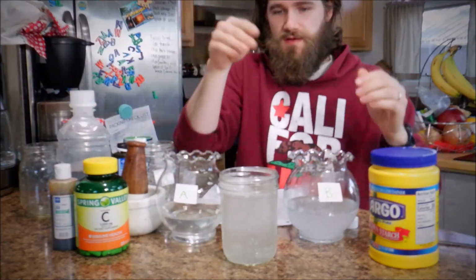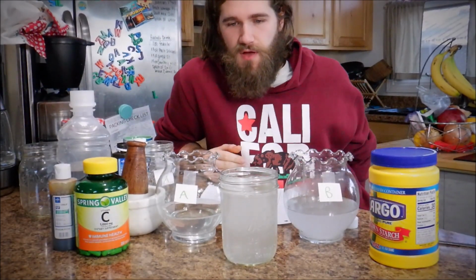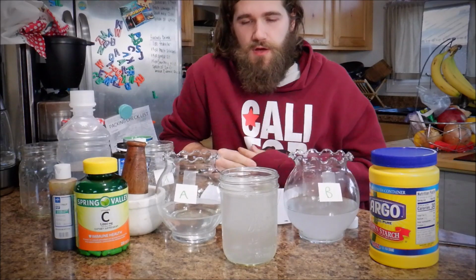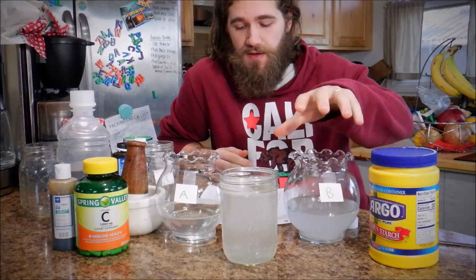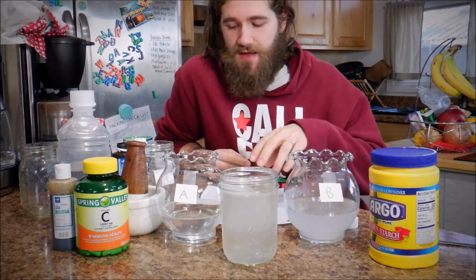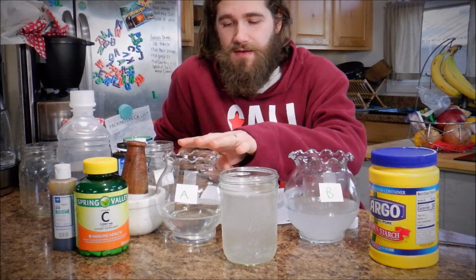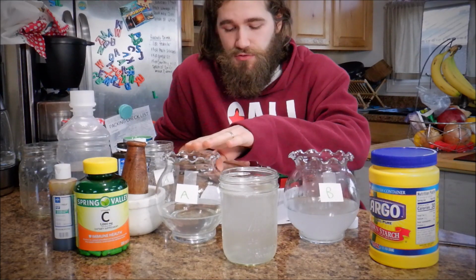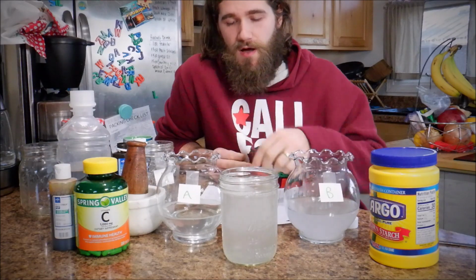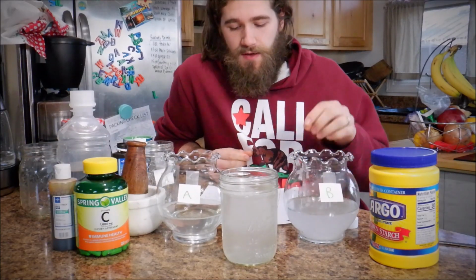What's happening here is we have two reactions kind of competing with each other, going back and forth. So we have the hydrogen peroxide in the solution B that wants to oxidize that iodide, the I negative, which is colorless, that we created in the solution A, back to colored I2 or iodine.